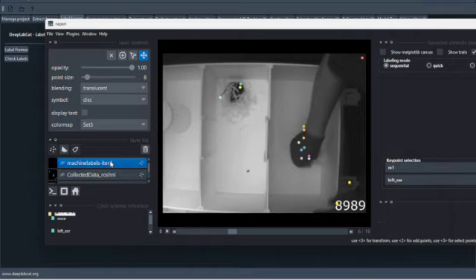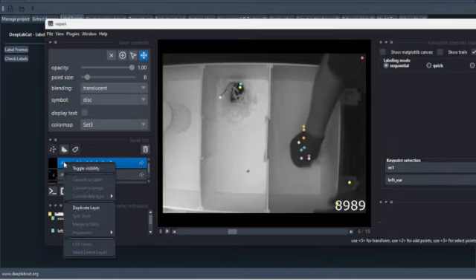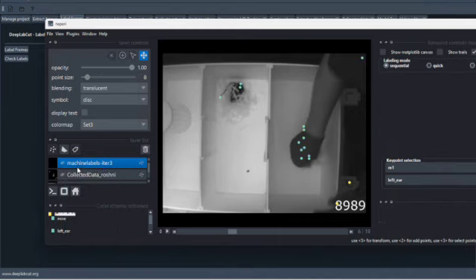So just make sure if you're coming back to this that you're actually changing the labels in the collected data Roshni file, not the machine labels file. And you can toggle the visibility of these on and off by right clicking and toggling the visibility, because otherwise you might be seeing labels from both the layers.